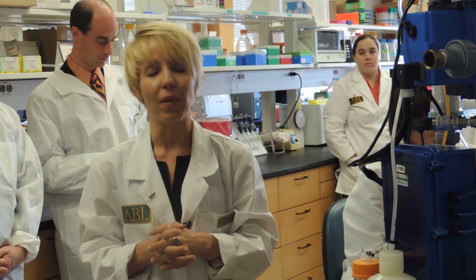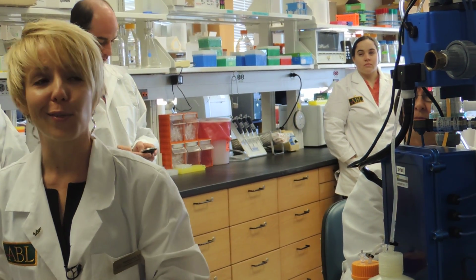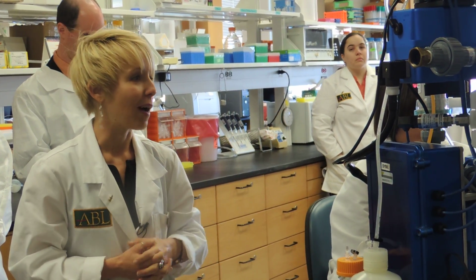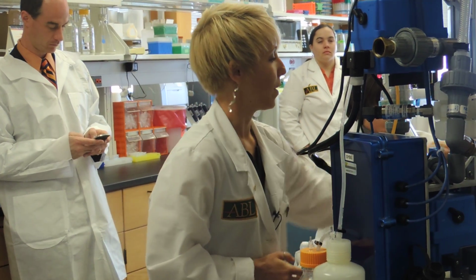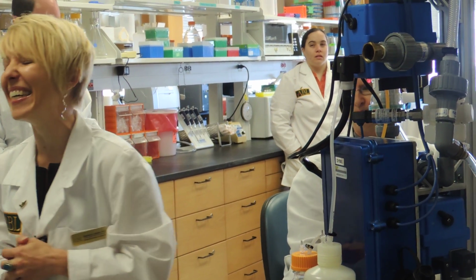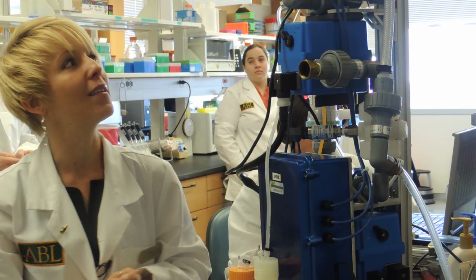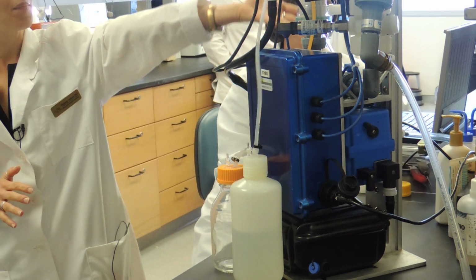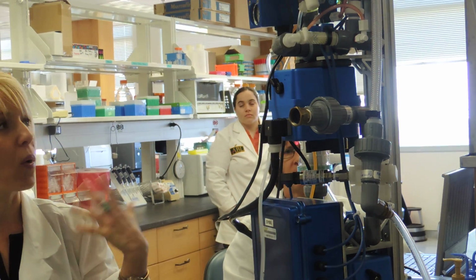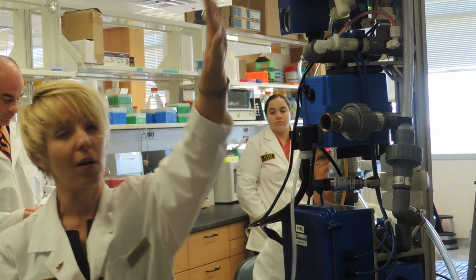Again, basically dewatering the sample. So we're taking all of the particulates in 100 liters and squishing them down to something in about the 400 milliliter level. So again, the valves will open in a certain timing. We will then activate the pump, and it's going to whine just a little bit. And so basically, again, what that's doing is just drawing the buffer fluid up into the unit and pushing it up through those same fibers that our sample was collected. And then once the proper amount of fluid has been delivered to the pump, the software again will tell the pump to stop.